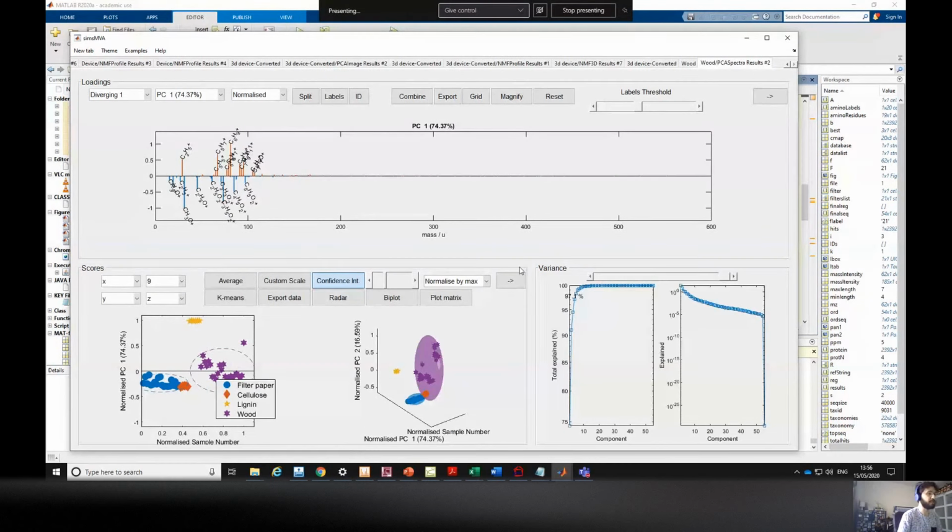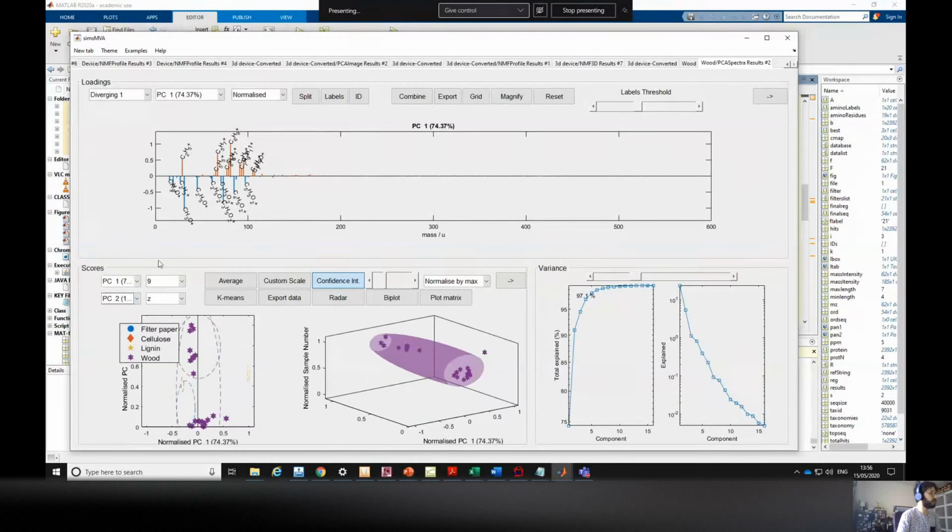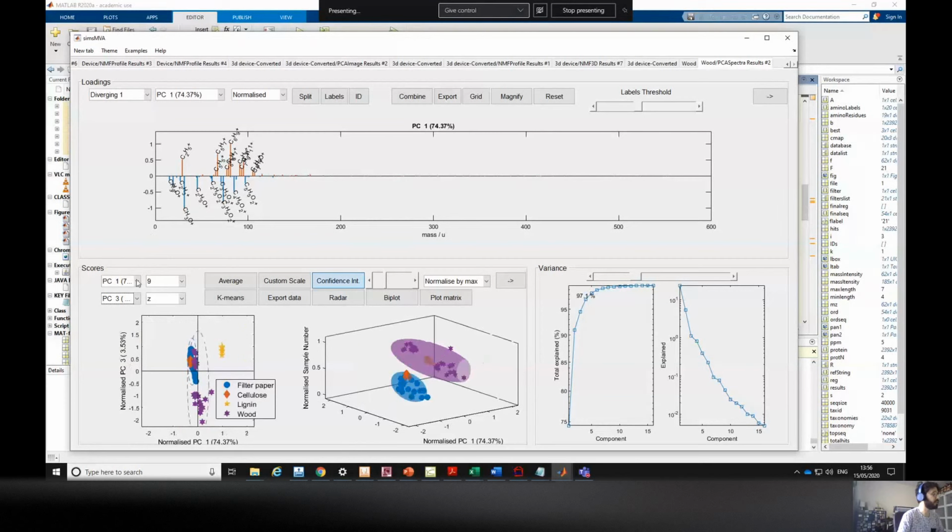So what I wanted to show is when you do PC1 against PC2, and then PC1 against PC3, PC2 against PC3. Yeah, so basically what I wanted to show is that when you do this, you tend to get these things grouped in clusters, right?